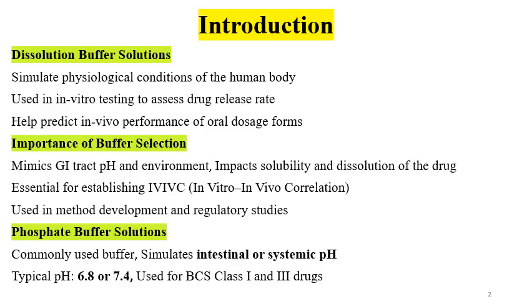Dissolution media is a medium or media in which the drug solubilization and drug release takes place. The actual formulation is exposed to the media, and in this media drug gets dissolved, drug gets released from the formulation.